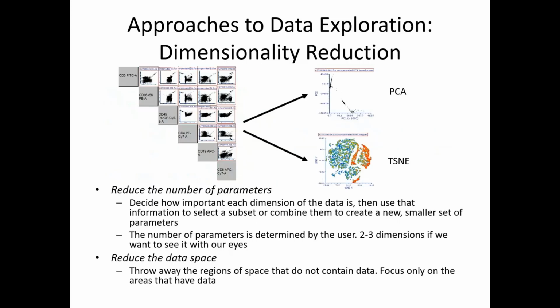Some of the other approaches that I talked about just before reduce the number of parameters. That is an approach taken by PCA. The classic example of this is PCA, although there are many others.